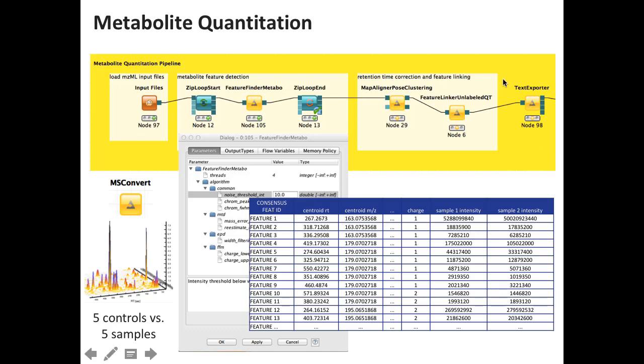Now, what falls out at the end of this pipeline here is then a table that contains everything you need to know for the quantification. You have a list of features, feature 1 through n. You have the centroid retention time, mass to charge ratio, you have the charge, and then you have columns per sample. Every sample simply has an intensity value, or has not available if it couldn't be found in this particular map. And that makes it very convenient to do downstream statistical analysis of this. You can go directly into R with it, you can export it to Excel, you can do whatever you like. The only thing that is missing at this point is, of course, the identification. You don't know what it is.